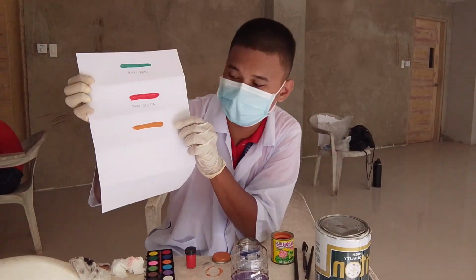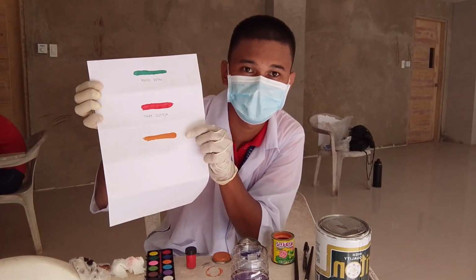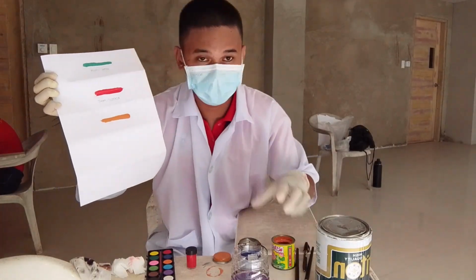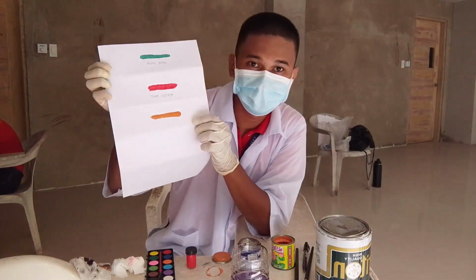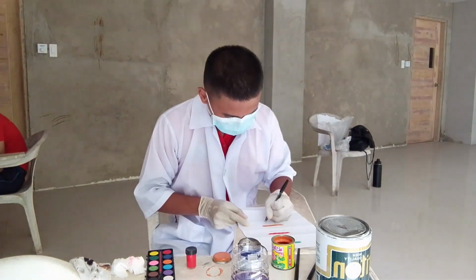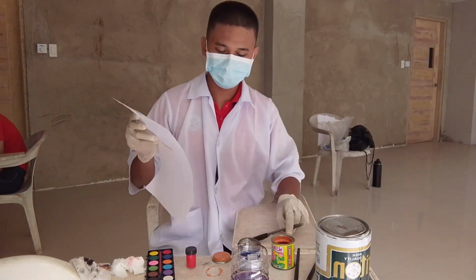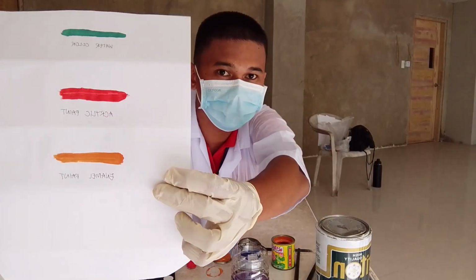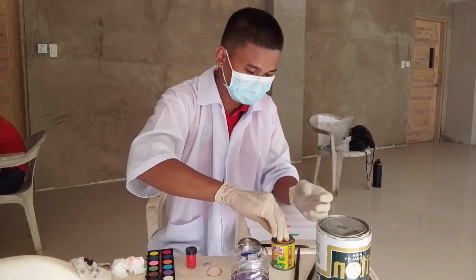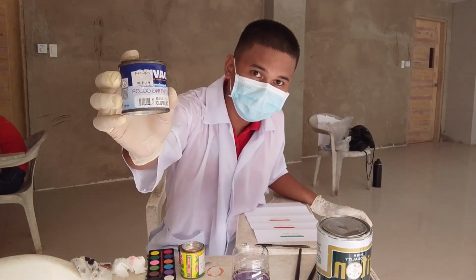For the color, I chose orange. For the shade, it is a dark shade. And for the paint type, it is enamel paint. So I will now label it. I am done labeling the enamel paint. I will now proceed to the oil paint.